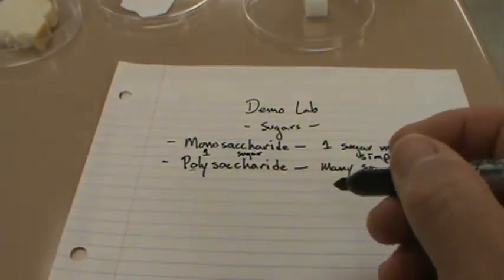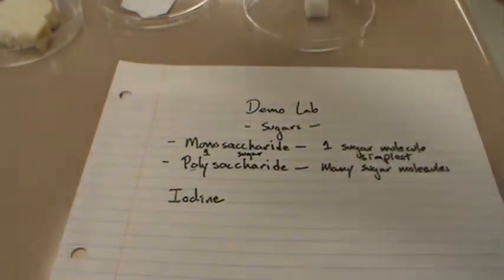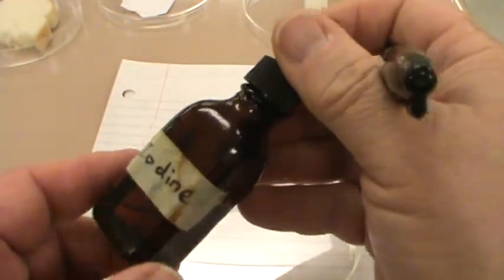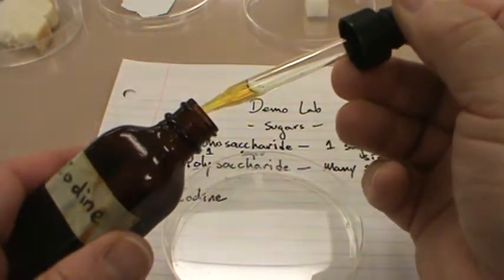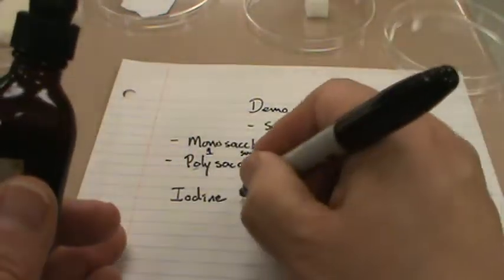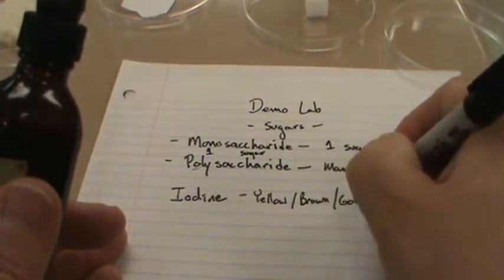So we're going to use iodine. It's what we call the iodine test. And we are going to determine if we can tell the difference between a simple sugar and a more complex sugar. So I have my bottle of iodine here. Let me squeeze this out for you. The critical thing here was what color is the iodine? And all day, most students were calling that color right there a yellow, brown, or even a gold color.